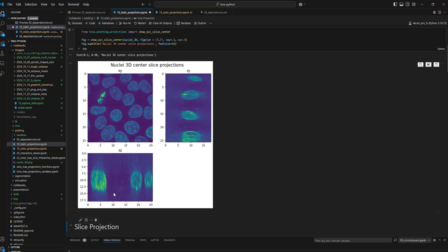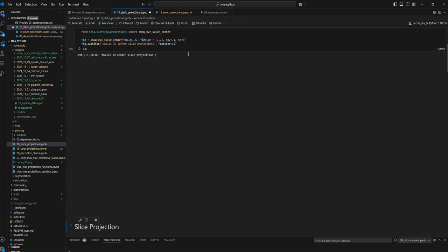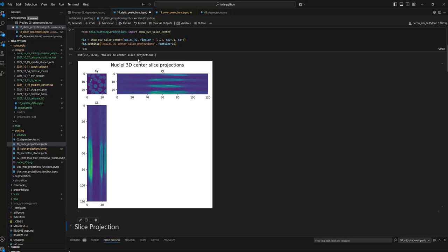And yeah, so there we go. That stretched out the Z. In particular, that's really useful. For this image, we could see what's going on even without stretching the Z. But sometimes you get images with like 2048 by 2048 by 20 or something, and the Z is really compressed and you can't really see what's happening. So sometimes even a bigger Z than the real Z is useful to see what is happening. In this case, this is exaggerated. For this image, we don't need to do that, but you could really stretch the Z if you had cases where you want to see what's going on.